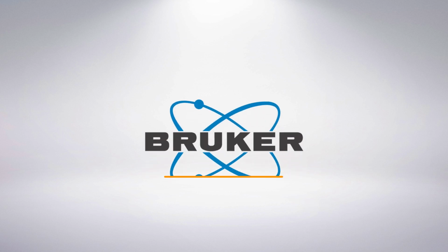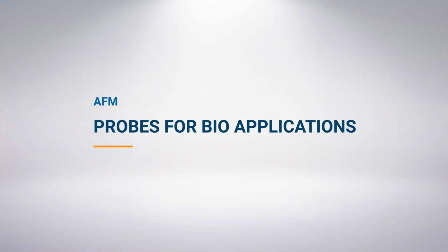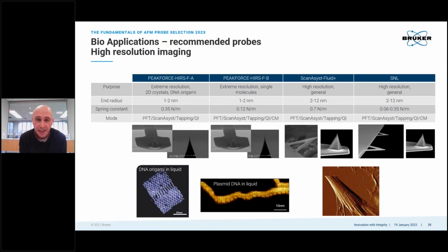So bio applications. Basically here we've got 4 different categories, I think. So this is high resolution imaging. And the first thing you'll notice compared to some of the material slides that John was showing is the spring constant. So in the next 4 slides, almost all of these spring constants, I'm sure, are less than 1 Newton per meter, because the samples are going to be very soft and delicate.